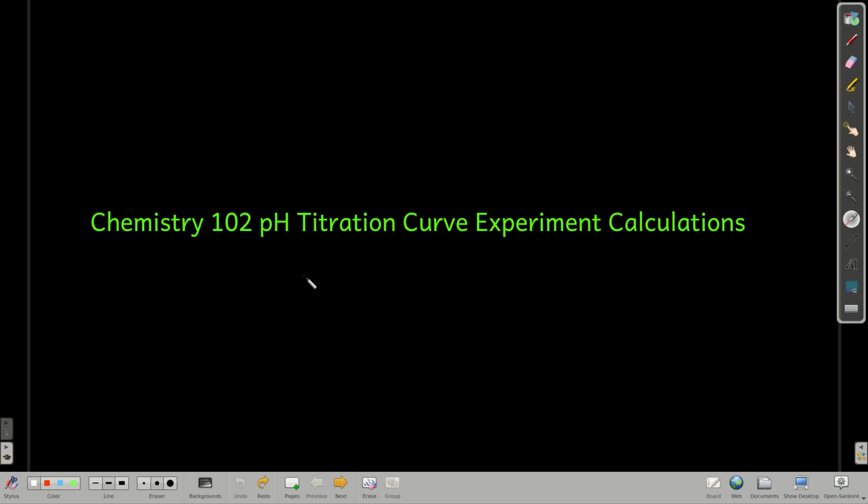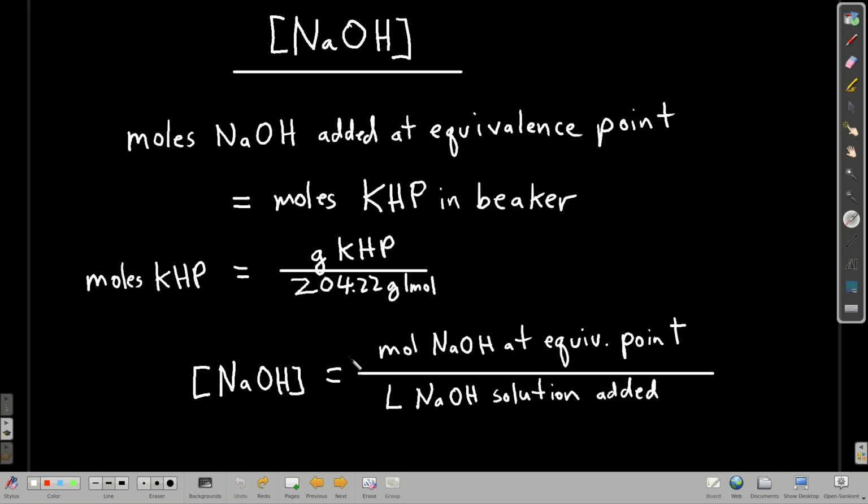In this video, I'm going to explain how to do the calculations for the pH titration curve experiment. Alright, so the first thing that you did was you titrated some KHP. The purpose of those titrations was to find the concentration of your sodium hydroxide solution. KHP is a monoprotic weak acid. Sodium hydroxide is monobasic, and so it's a 1-to-1 mole ratio between sodium hydroxide and KHP.